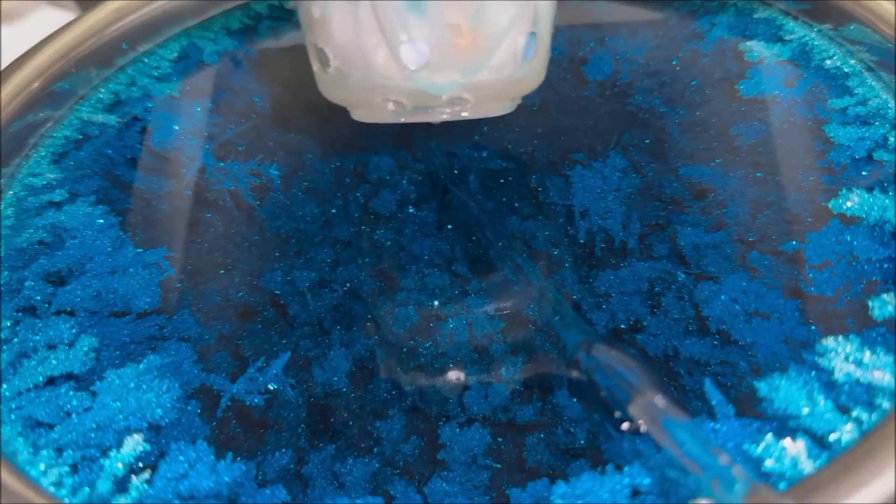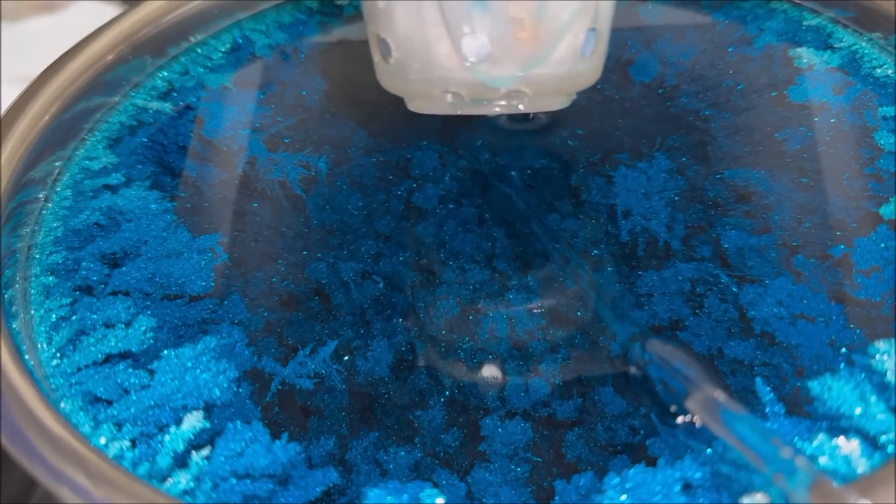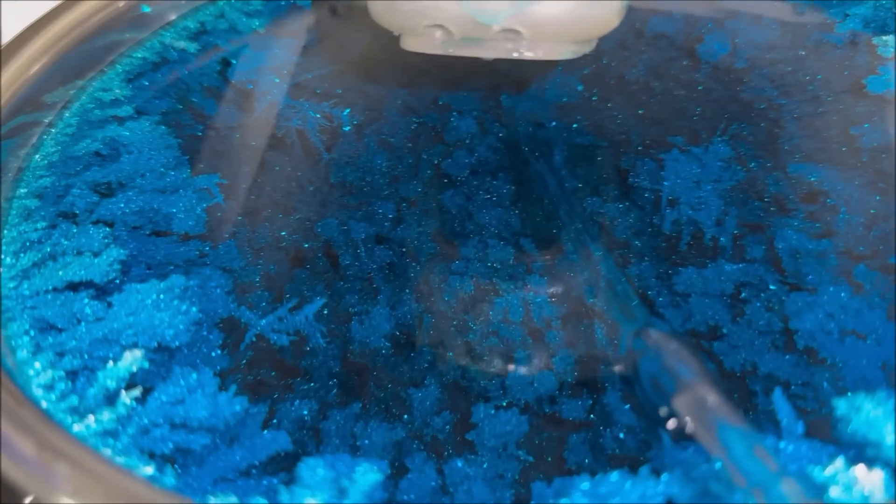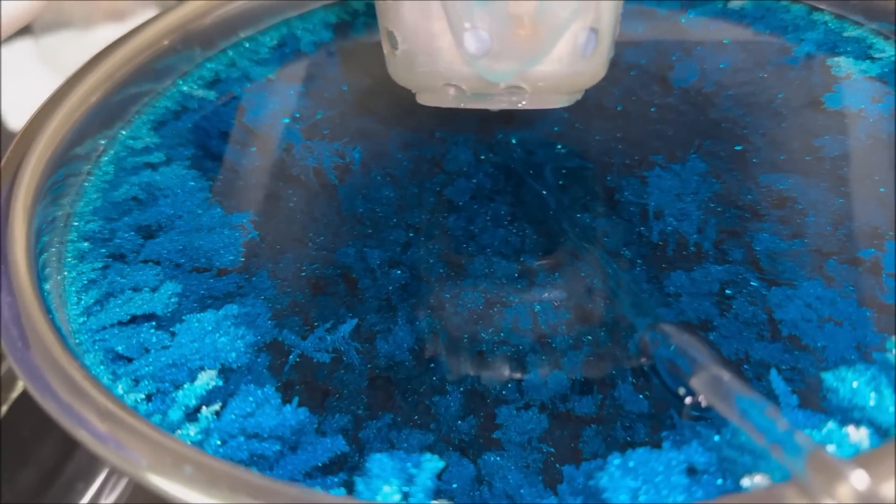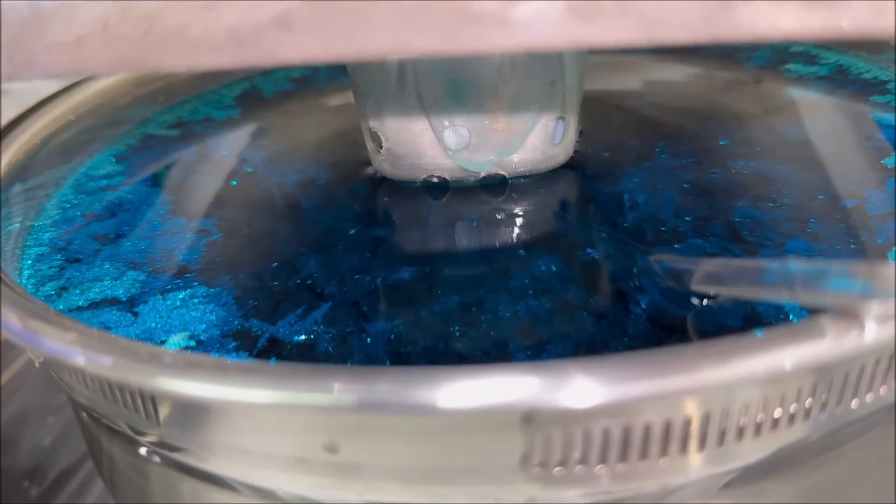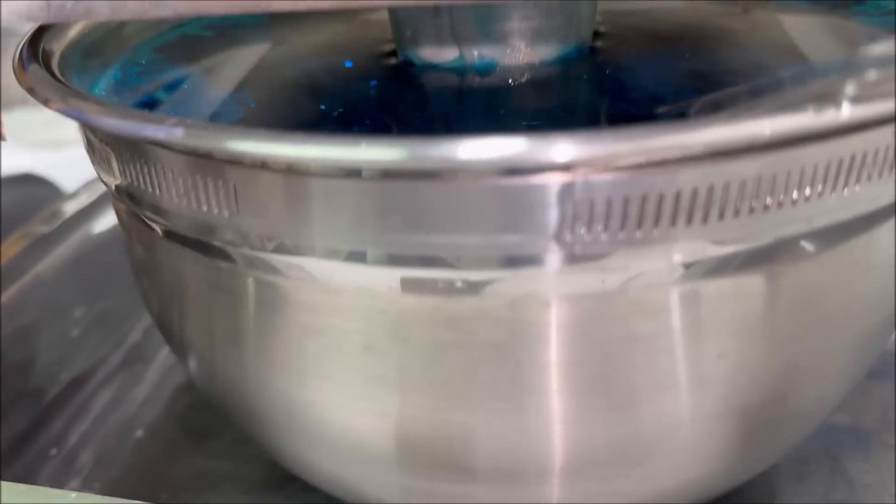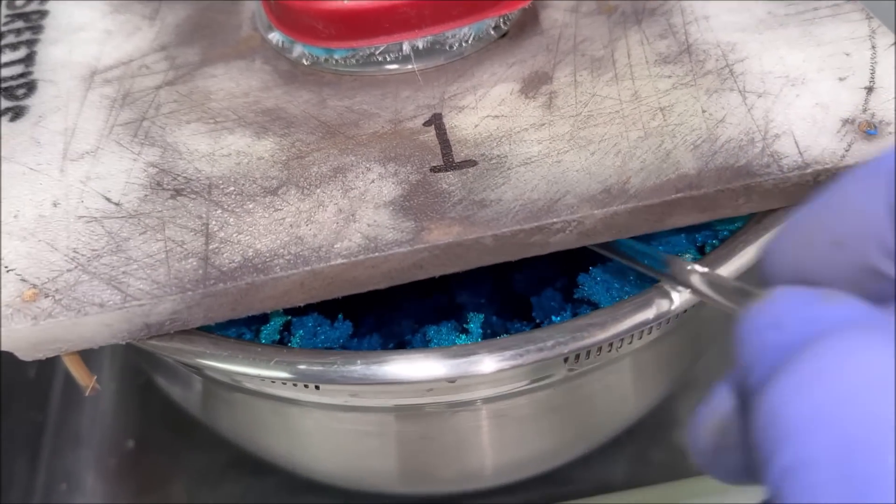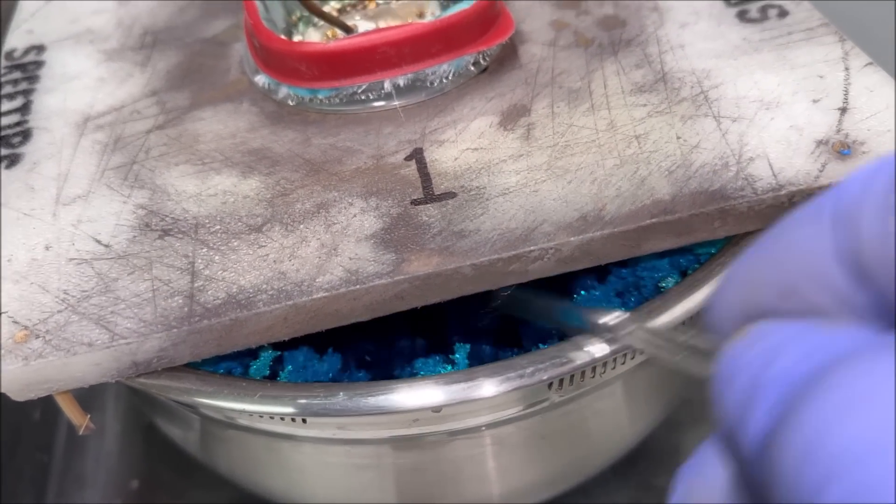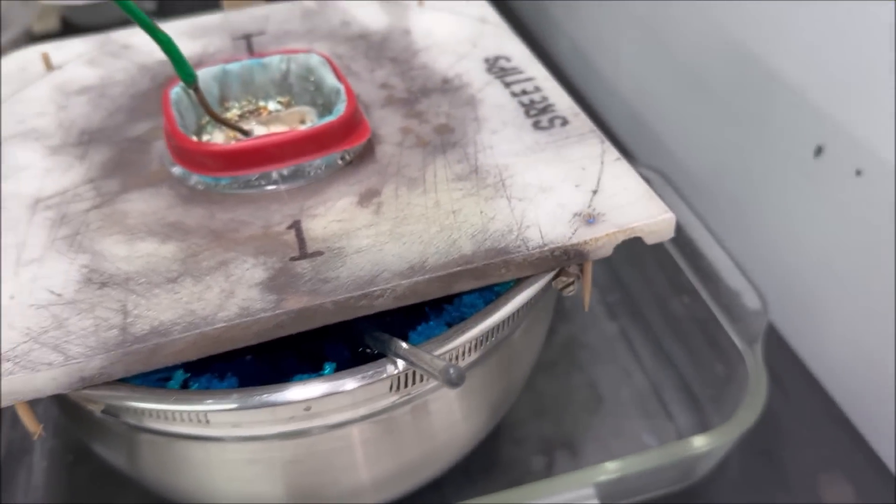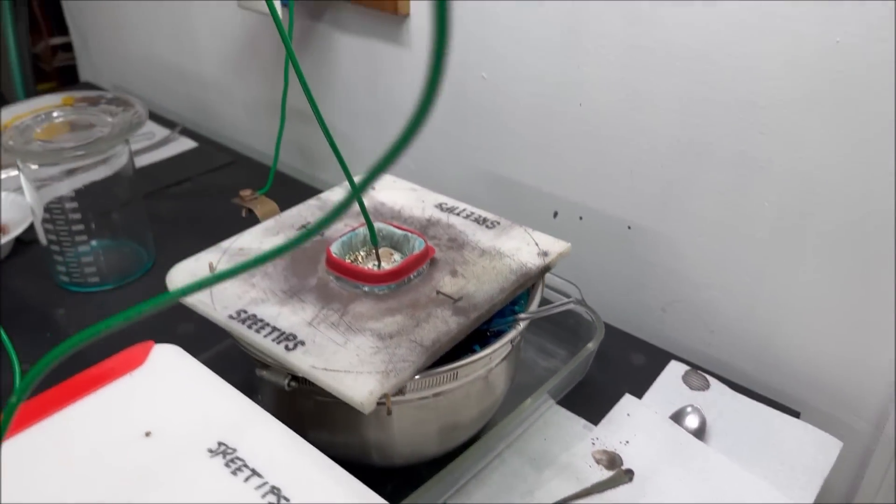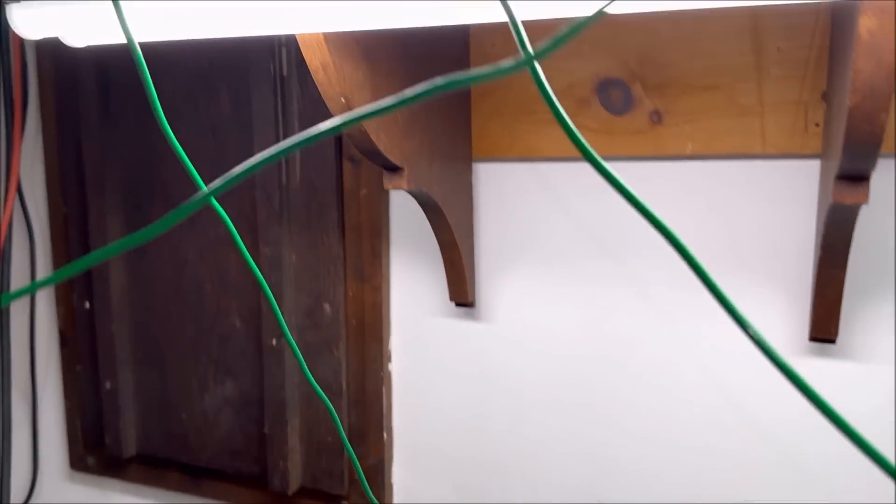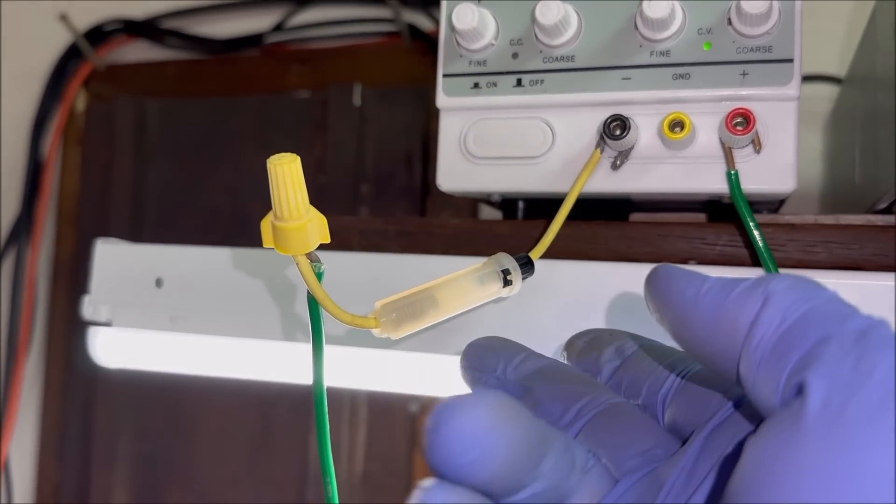If we let it run too long, what will happen is that silver crystal will come in contact with the anode filter basket there and short it out. So we'll probably have to go ahead and harvest this tomorrow. I'm going to try to knock some of those crystals down in there so we can create some room to prevent that from happening.